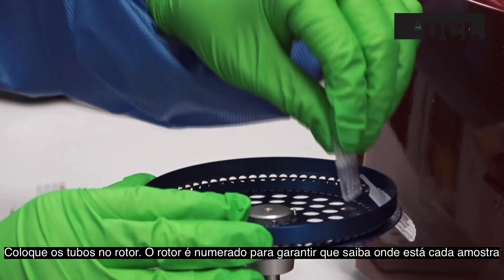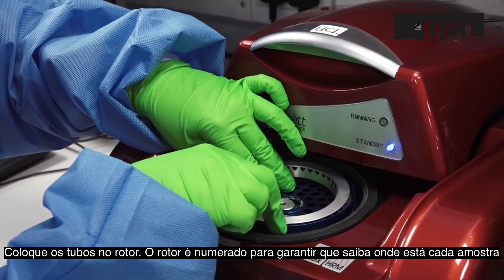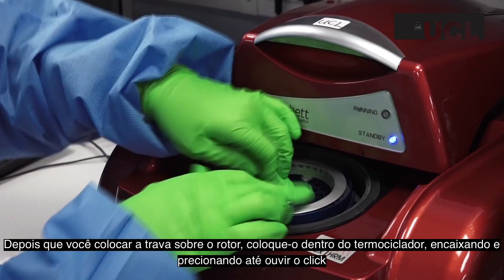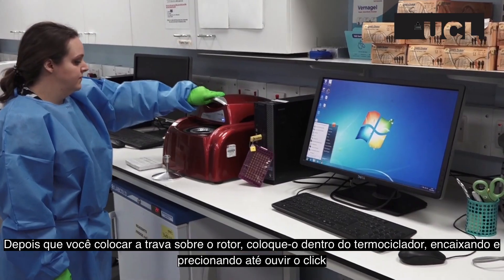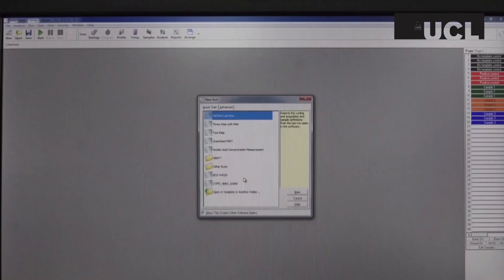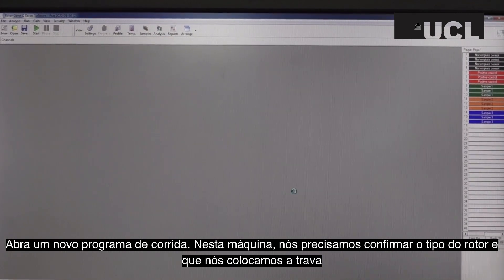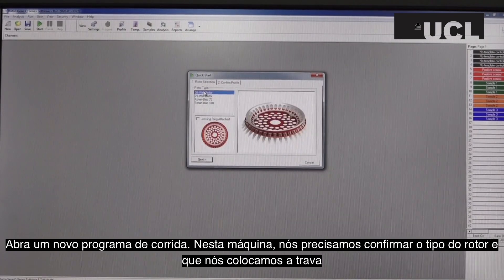Place the tubes into the rotor. The rotor is numbered to ensure that your samples do not get confused. Once you have placed the silver locking ring on top of the rotor, place it into the thermocycler, lining it up with the pin and press it down until you hear it click. Close the lid of the thermocycler and then open the thermocycler program on the computer. Open a new run in the program. On this machine, we have to confirm the type of rotor and that we have attached the locking ring.